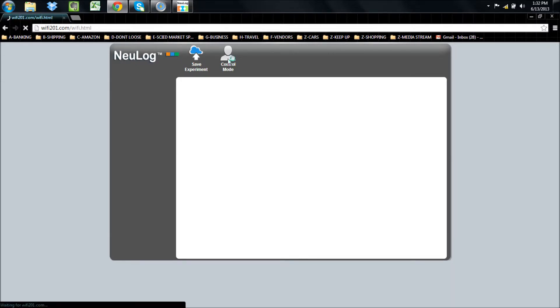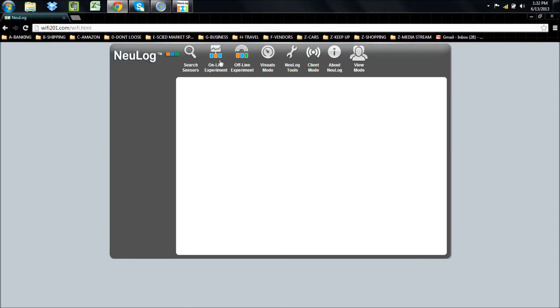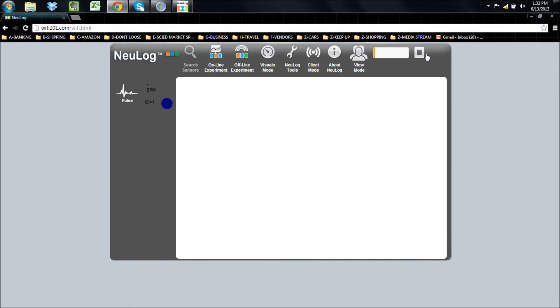Now that we're connected, we simply click on the control mode button to control the software. If other devices connect, they'll be in view mode, which allows them to view and manipulate data, but not start or stop the experiment. This prevents people from starting or stopping the experiment accidentally.